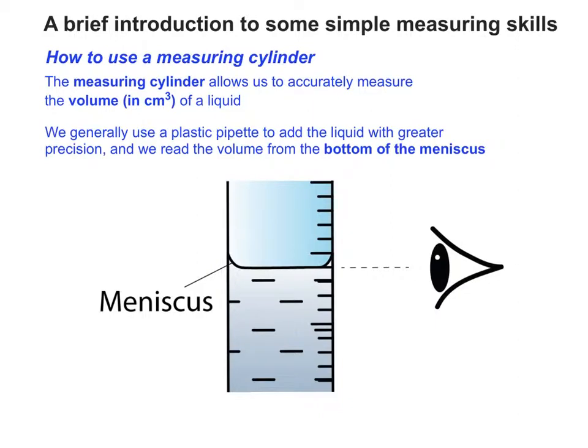When you read the meniscus, the meniscus is basically where the top of the liquid sits, and there's a slight curve upwards where it comes into contact with the inside of the measuring cylinder. So it's very important that your eye is at the level of the bottom of the meniscus, as can be seen in the diagram.